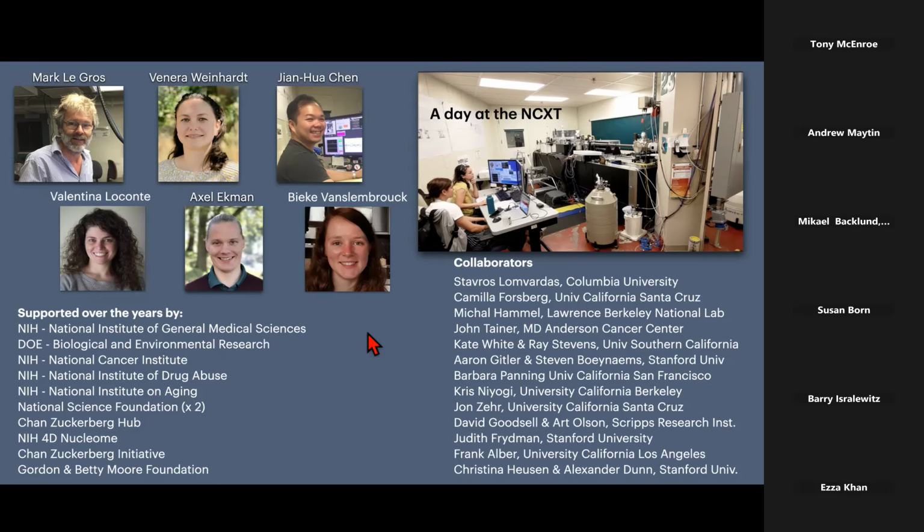So the one thing that I'm always excited about is the 360-degree resolution. I just don't fully understand the mechanism. So is it that you have projections, and are there no low resolution spots in an image, or does that give you uniform resolution even though you're only rotating it? Yeah, you go around the whole cell, even though the gaps are along the axis of rotation, for example, and you don't lose any resolution there. It's minimal, it's very, very minimal, and the work Axel could talk about forever.